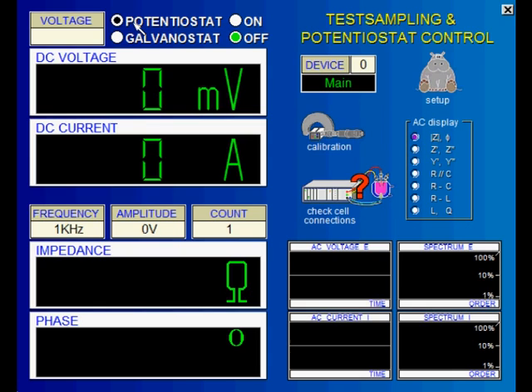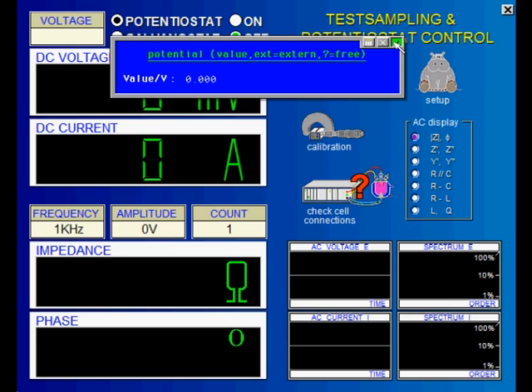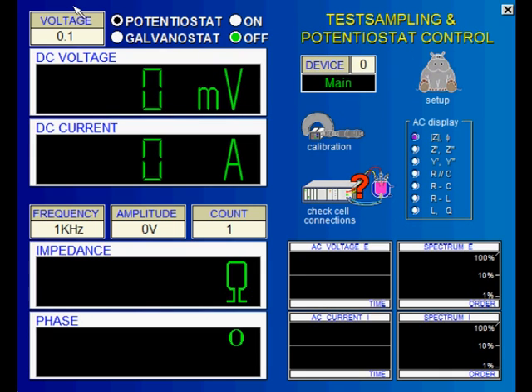Now set the DC value by entering the value in the input box. If you want the rest potential to be set automatically, simply enter a question mark or a blank line instead of the value with potentiostatic mode selected. Please note that if you enter 0V, the potential is always kept at 0V and not at the OCP, which may differ from 0V drastically.